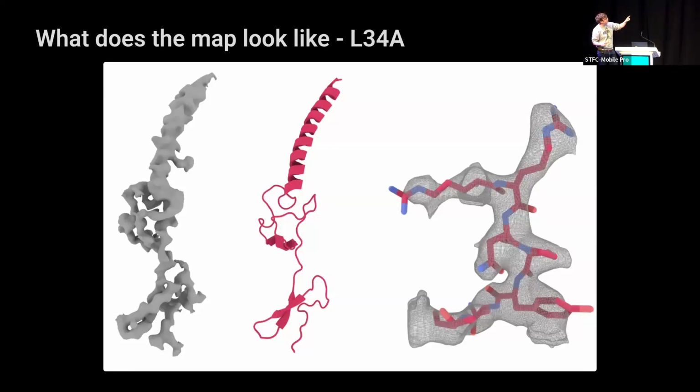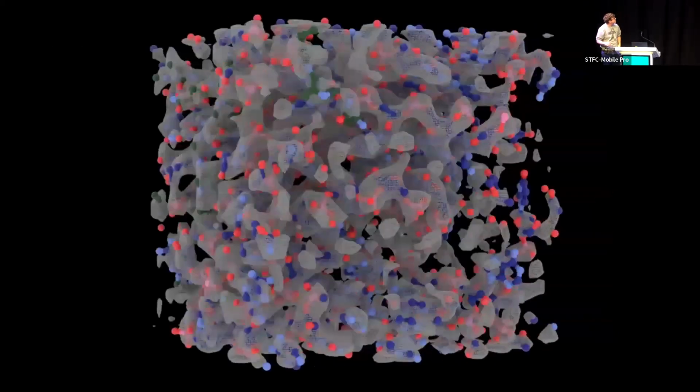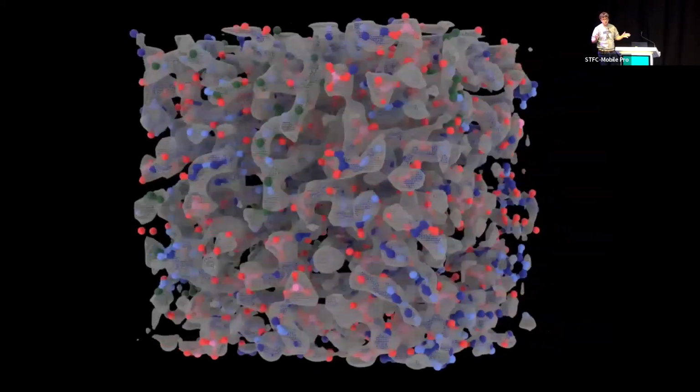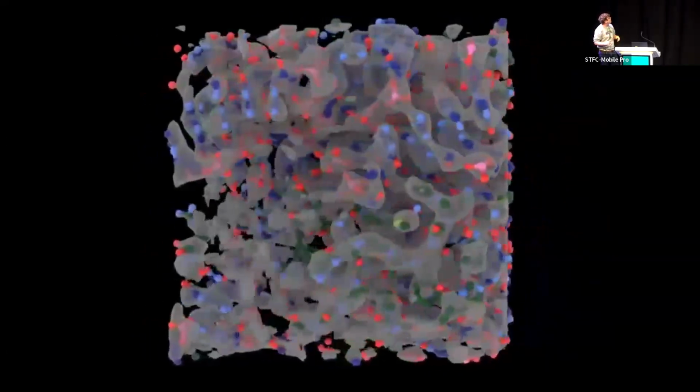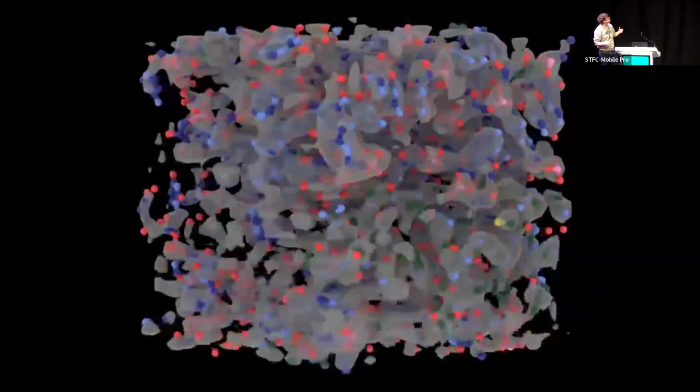This map, I think I filtered through 3.5 angstrom resolution and applied a B factor of -70. That's the only map modification I did, because we want to give as raw an impression of the resulting data as possible. So it is definitely noisy. And then this is the map of the central cube. Again, we think it's a pure reconstruction of the density. And I think it looks pretty nice.